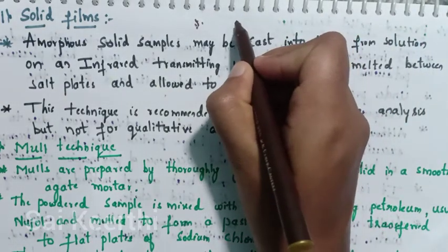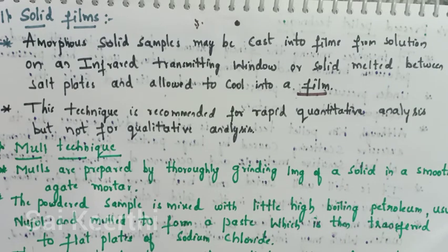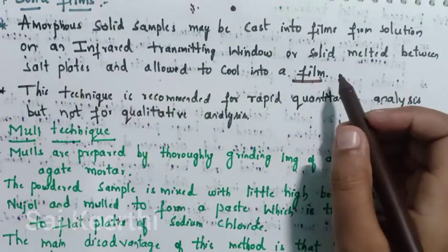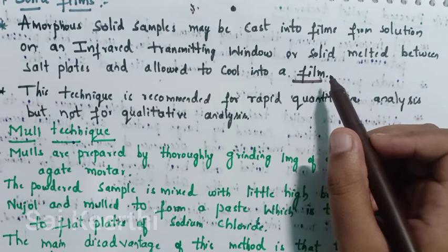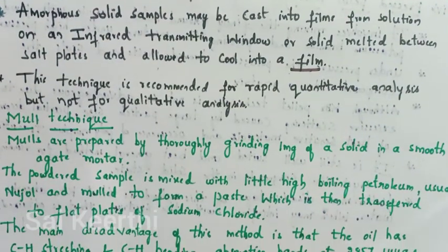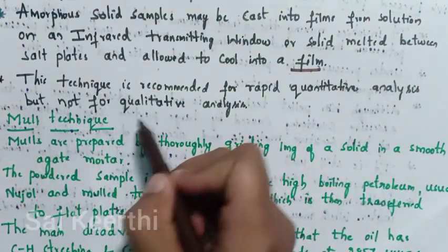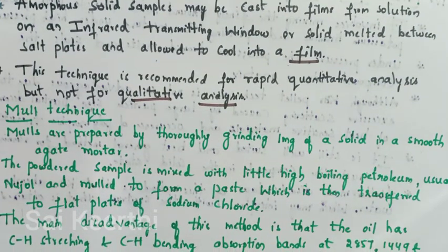This film is examined, and this technique is recommended for rapid quantitative analysis but not for qualitative analysis. This is a very important point.